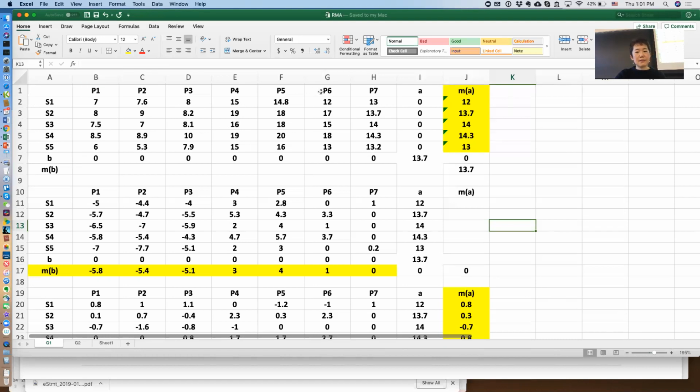For the probes, we have 10 or 20 or 15 perfect match probes, but I'm only showing you 7, just so you get some idea. So this is the probe value for the first sample, and these have been quantile normalized and logged already, okay? And this is the probe value for the different samples.